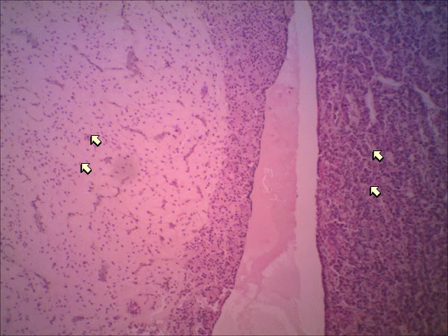Now, I'd like for you to look in your lab manual, if you will. Look on page 276 under Procedure A 5C. Here it says, observe an area of the anterior lobe with high power magnification. That's what we're doing right now. So over on the right-hand side of the screen where I'm putting more arrows, this one is the low power magnification.